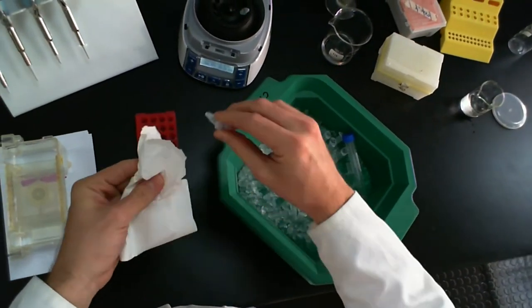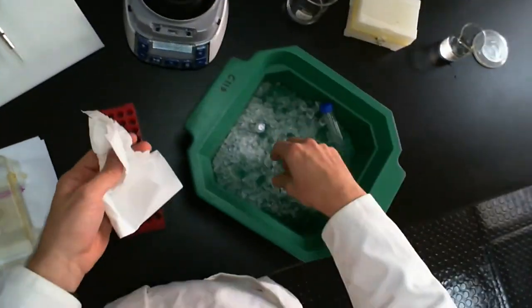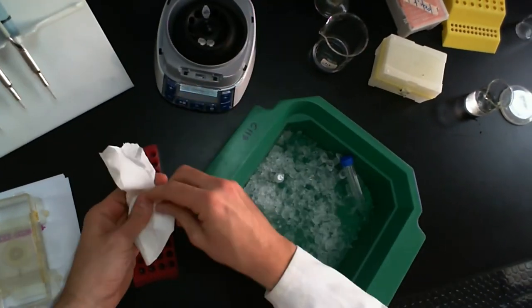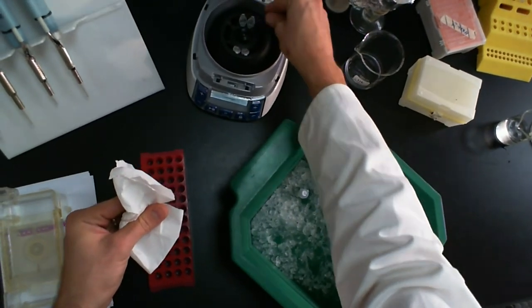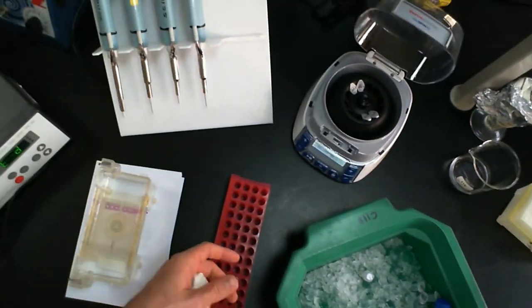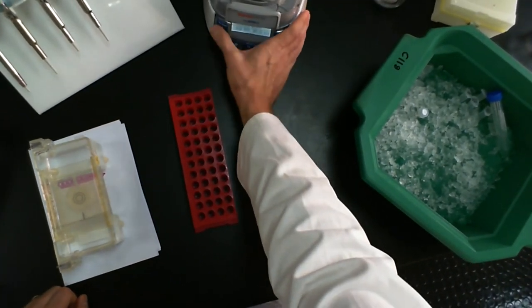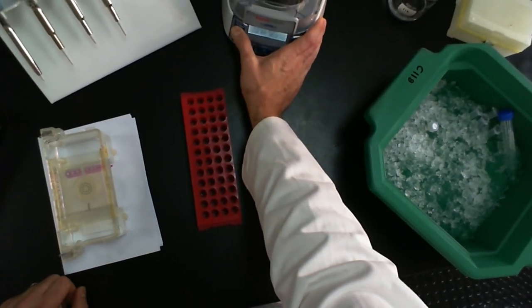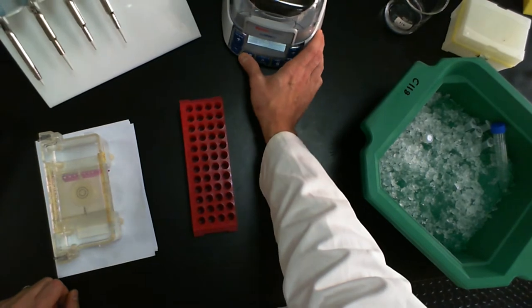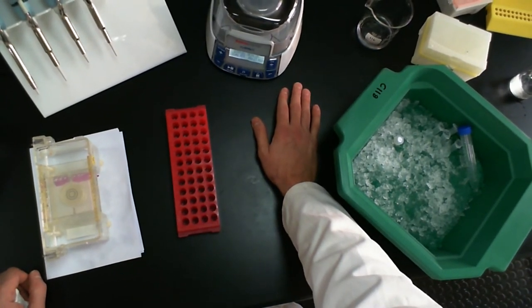Wipe these down. And then I can just put them side by side and balance them. Just make sure they're balanced. And here, that should be balanced, with 4 empty spaces on either side, so that's balanced as far as I can tell. Put the lid on, close it without slamming the lid shut, and we're going to increase the speed to something a little bit more reasonable. The actual speed really doesn't matter. We're just going to do a quick, fairly brief spin. It's just there to spin down all the liquid to the bottom of this microfuge tube.